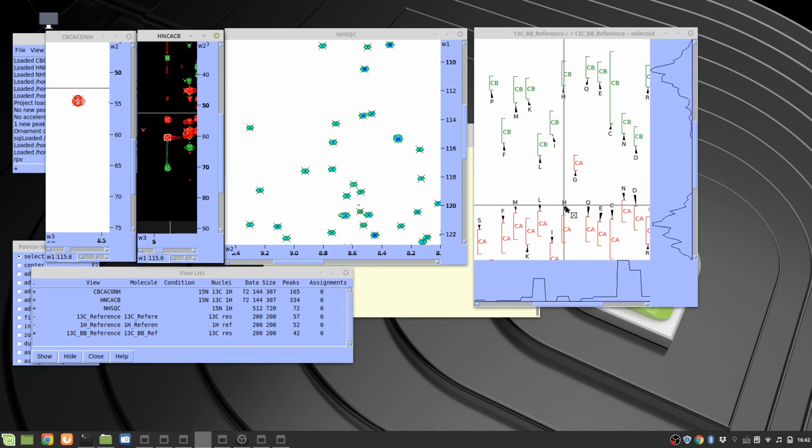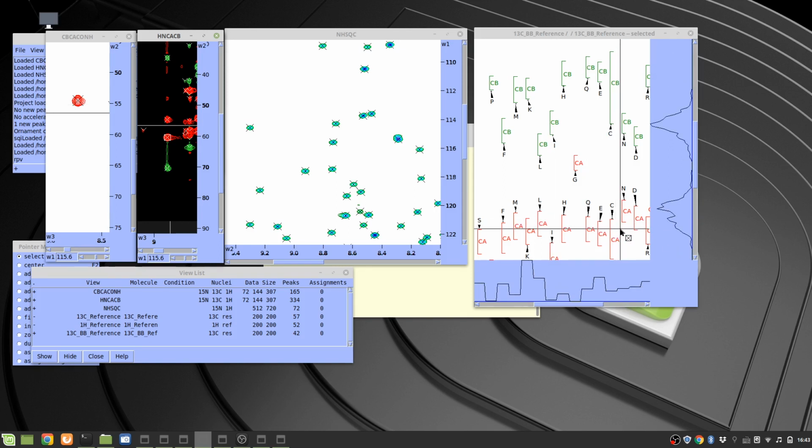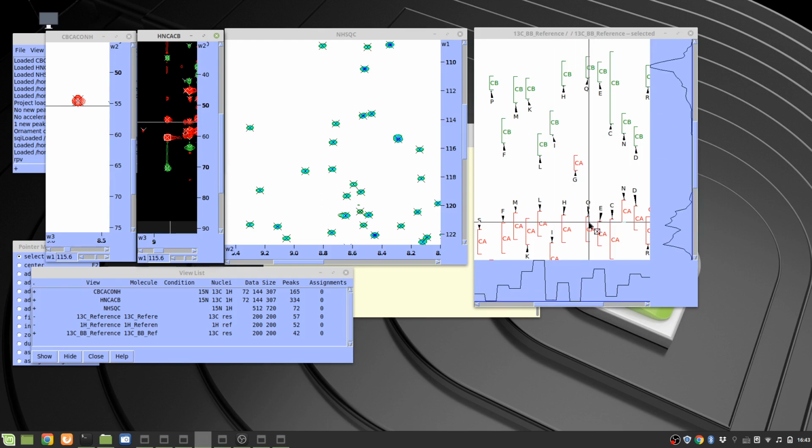That's very useful. And you can also see how the chemical shifts are distributed along the y-axis. They are from the BMRB database, curated by PACSY and the iPine web server. That has been validated for such a long time, so they are very reliable. And as you can see, they are not really Gaussian.